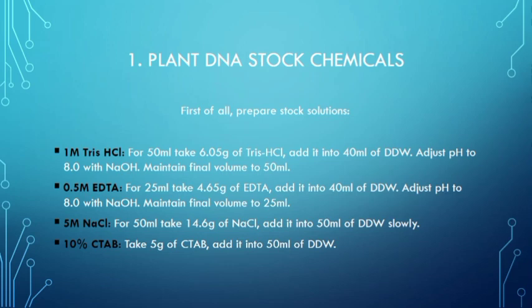So stock solutions are very helpful. You just make your stock solutions, and every time you extract DNA, you just dilute your stock solutions and use them freshly.